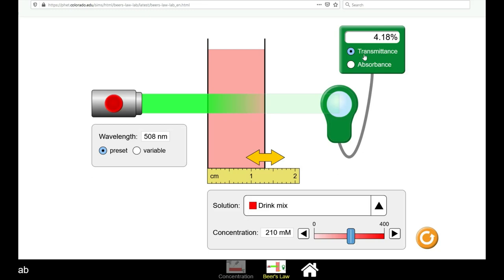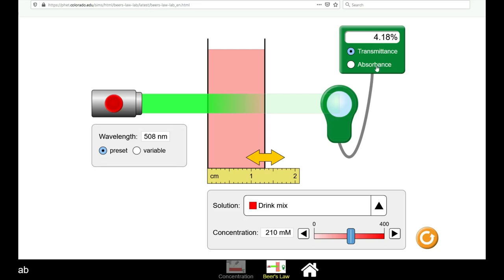You can have the display output in either transmittance or absorbance. Transmittance is preferred as it is much easier to measure transmittance and convert to absorbance levels than it is to measure absorbance directly.